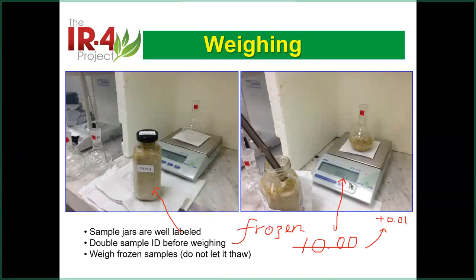So the accuracy, because if you weigh 10 grams, even the number will change in this way. So your weigh-in error here will be what? If we talk about science error, it's not a human error.